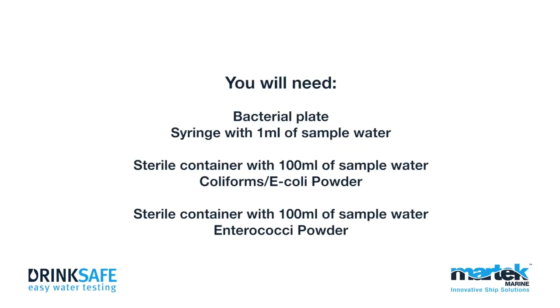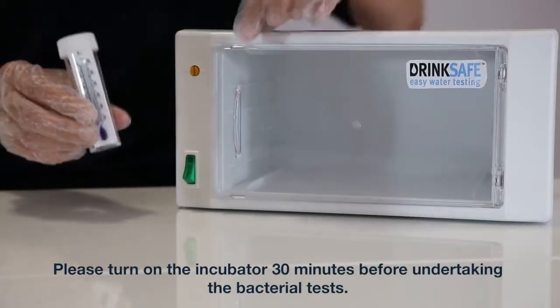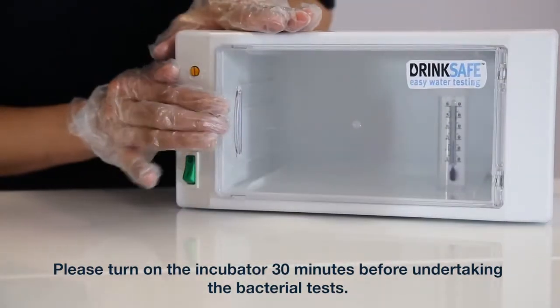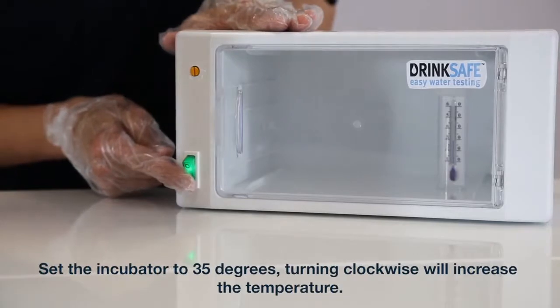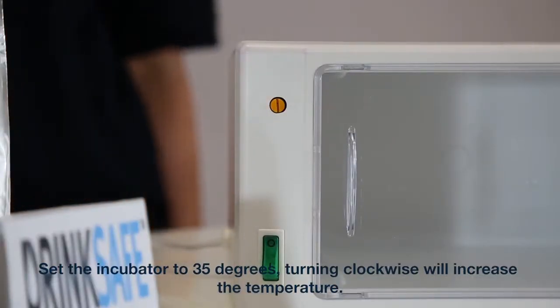You will need: a bacterial plate, a syringe with 1ml of sample water, a sterile container with 100ml of sample water, coliforms E. coli powder, a sterile container with 100ml of sample water, and enterococci powder. Please turn on the incubator 30 minutes before undertaking the bacterial tests. Set the incubator to 35 degrees. Turning clockwise will increase the temperature.